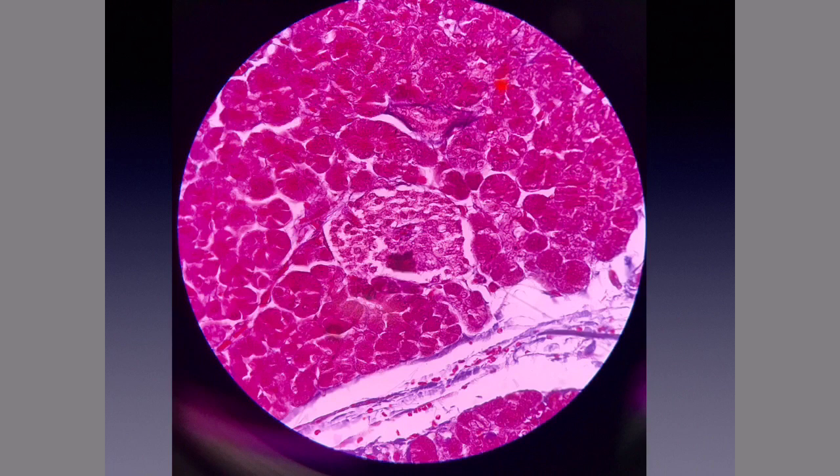What we're looking at is pancreatic tissue here, pancreatic parenchyma. This is all the acinus in through here, and this specific structure here is actually the endocrine, the active endocrine component of the pancreas, or the pancreatic islet. Or if you put the islet of Langerhans, you would be fine as well.